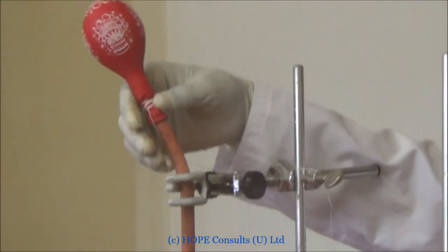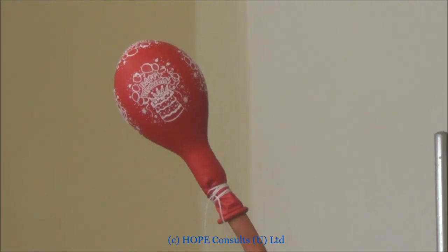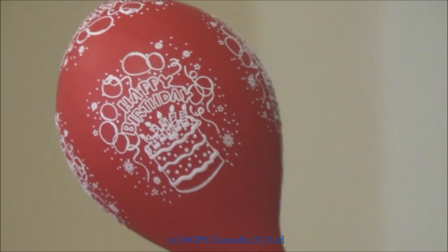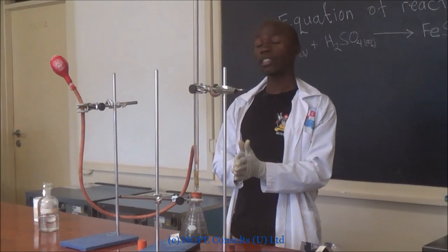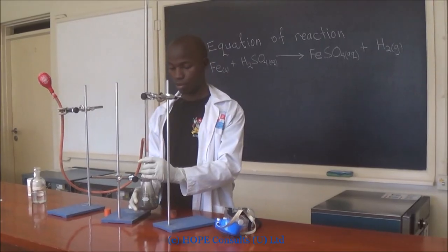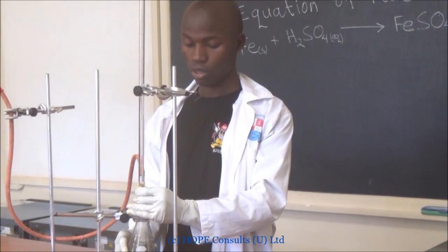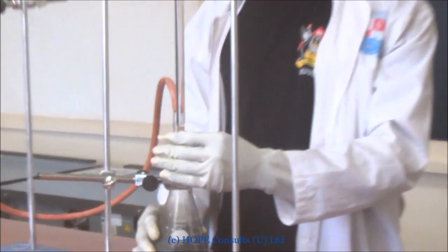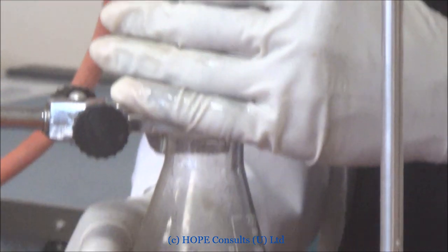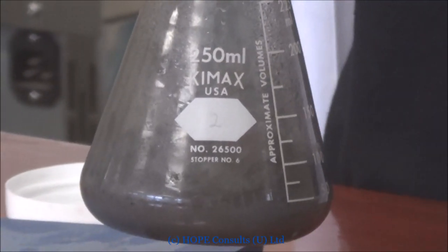The gas is still evolving. I just need to give it time. The gas is evolving as the reaction is taking place and it is collecting into this balloon. The sulfuric acid reacts with the iron, the gas is evolved, and the balloon will enlarge.